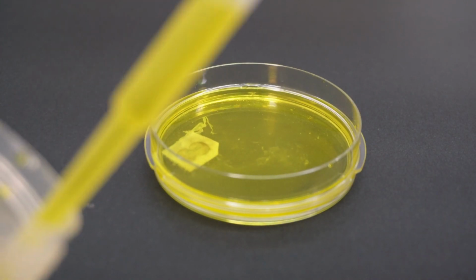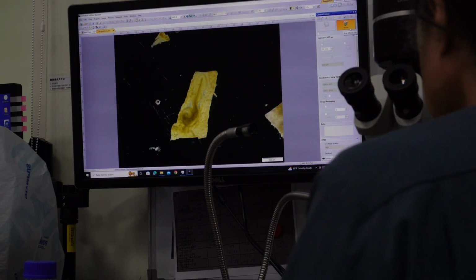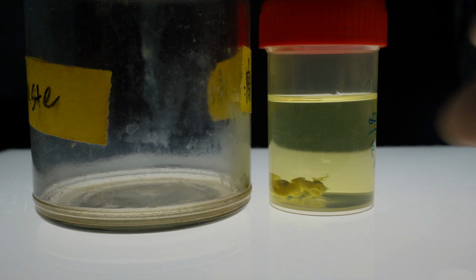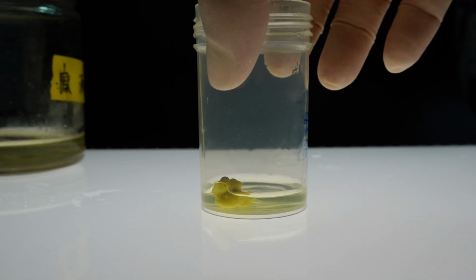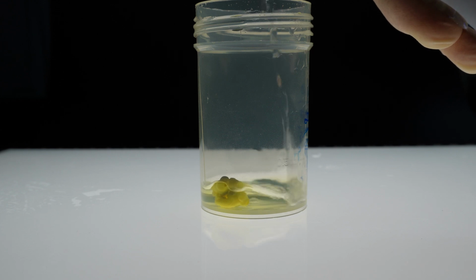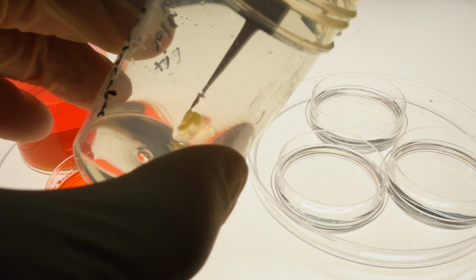After fixation, what's next? Okay, so after fixation, the tissue is preserved, but it's full of water. And the goal is to eventually embed it in paraffin wax, which hates water. It's hydrophobic. So you need to get the water out. Exactly. Through a process called dehydration, you pass the embryo through a series of ethanol solutions with increasing concentrations. Like 70%, then 80%, 90%, up to 100%?